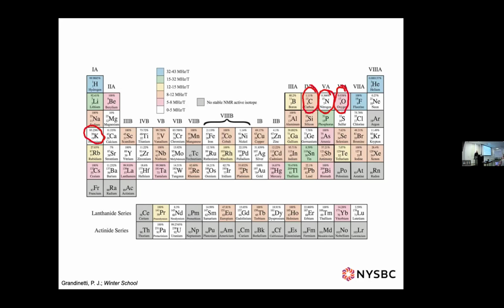You can see the ones that jump out, things like lithium-7, proton, fluorine, phosphorus, and tin. Tin is nice. Thallium. Some of those are in a no man's land where we can't tune most of our probes. The big problem is that once you get in between fluorine and phosphorus, most probes aren't tunable there, because there's not much in that section, so it's not worth designing a probe that tunes to it.